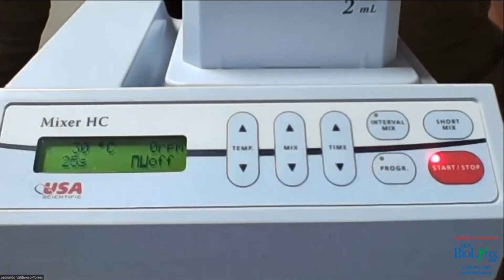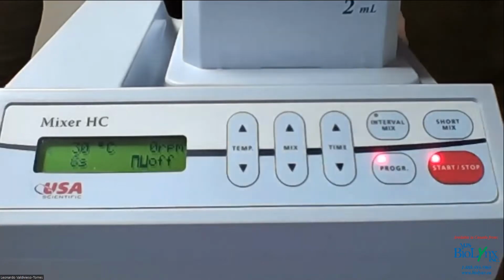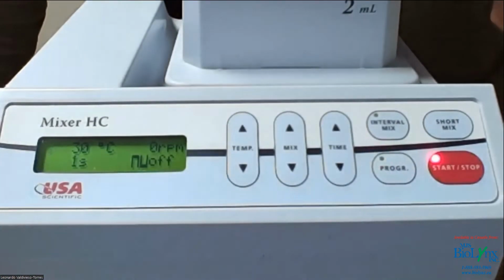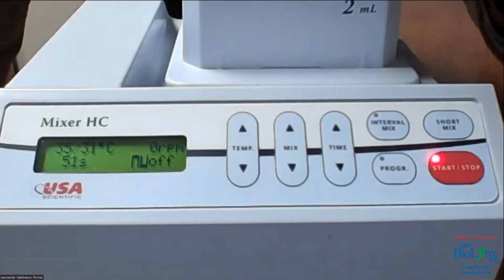So the other program that we're gonna do after this is the intermittent function. Like if you were doing the primary cells work that I talk about, that goes for 1 hour, 37 degrees Celsius, and you're mixing the sample every 15 minutes. Some protocols even call for every 7 to 8 minutes, so that will be even more hands-on. But in this case, I'm gonna do it just for demonstration purposes. I'm gonna set it up at 1 hour, 37 degrees Celsius, and then I'm gonna do 10 seconds pause and 5 seconds mixing, okay?